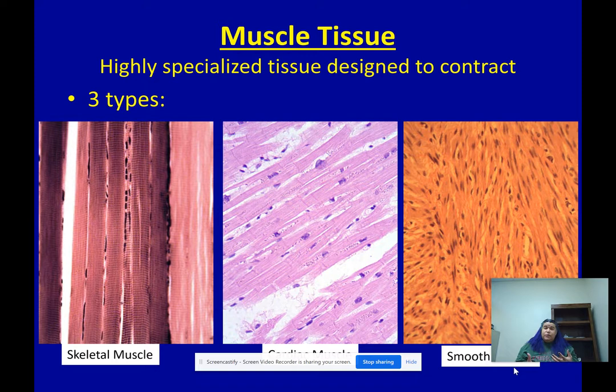When you're developing in the womb, individual cells are actually becoming one long fiber of a cell. That's muscle fibers. That's why we call the skeletal muscle cells muscle fibers, because they look like strings. Anybody who's ever had a chicken breast, you pull on the chicken and you get kind of stringies, that's actually the skeletal muscle cells. So that is one big landmark when you're looking at the slides, that you're looking at skeletal muscle versus cardiac muscle.